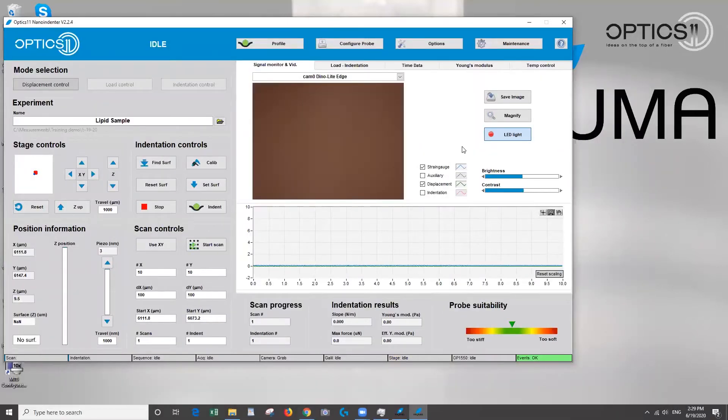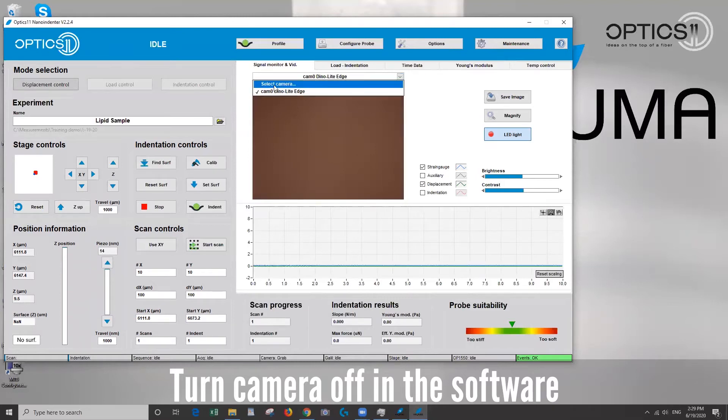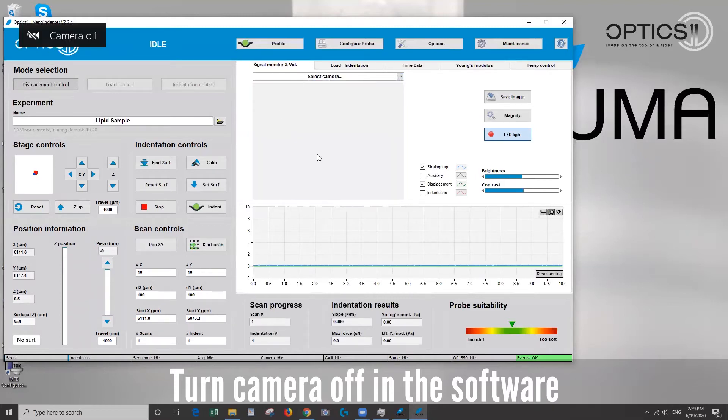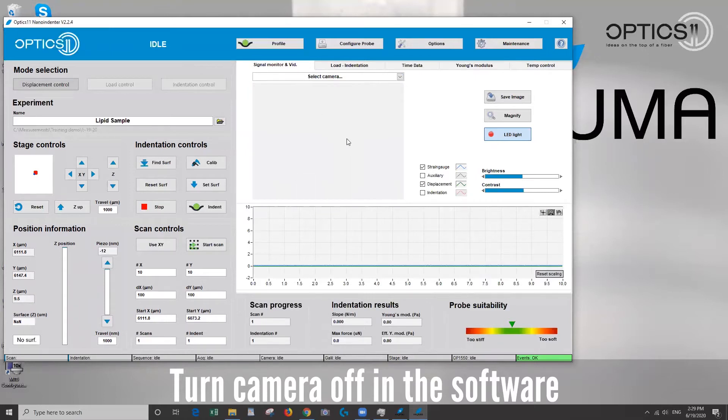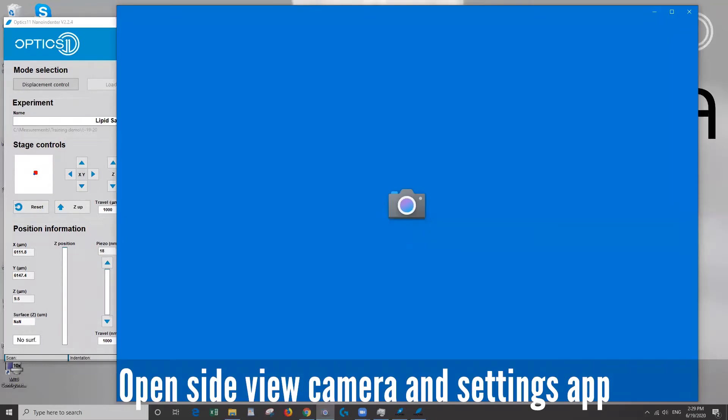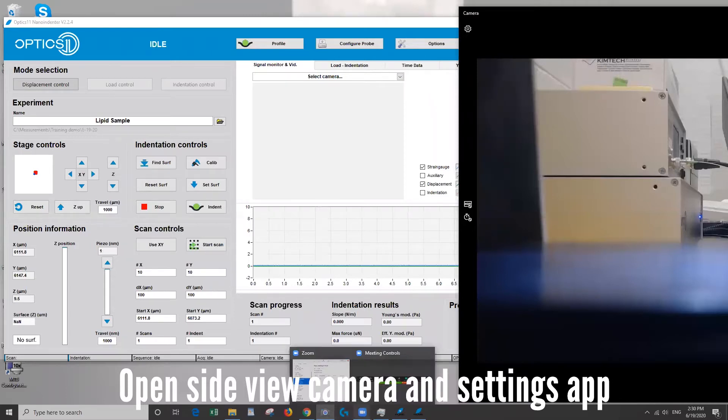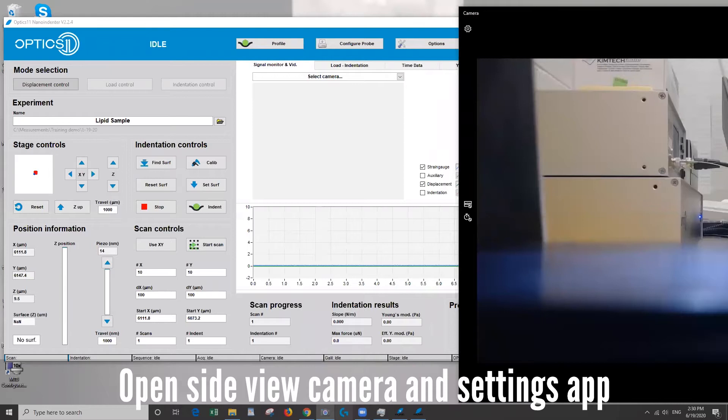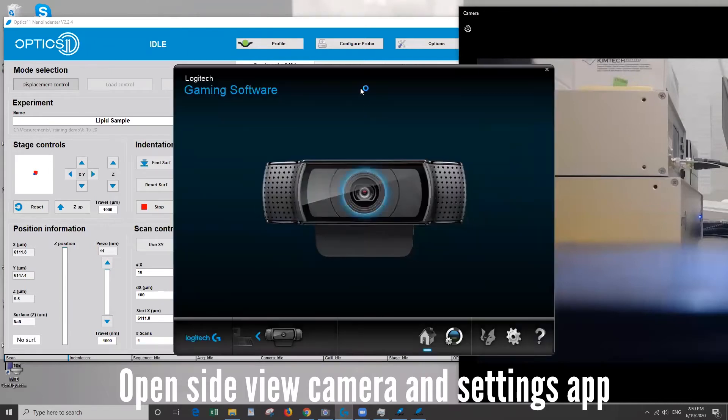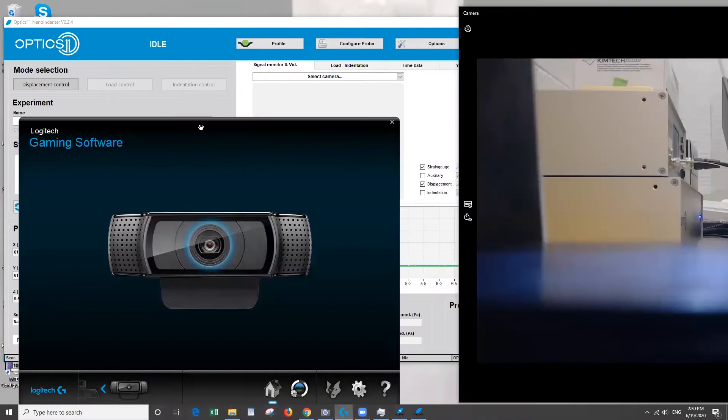Okay, so the next thing I want to show you is to come up here and click on select camera. This will turn the camera off in the software and that's because we want to come down here and you see I have some icons pinned to the taskbar. Let's open up the camera window. This software here is going to allow us to control the settings of our webcam.